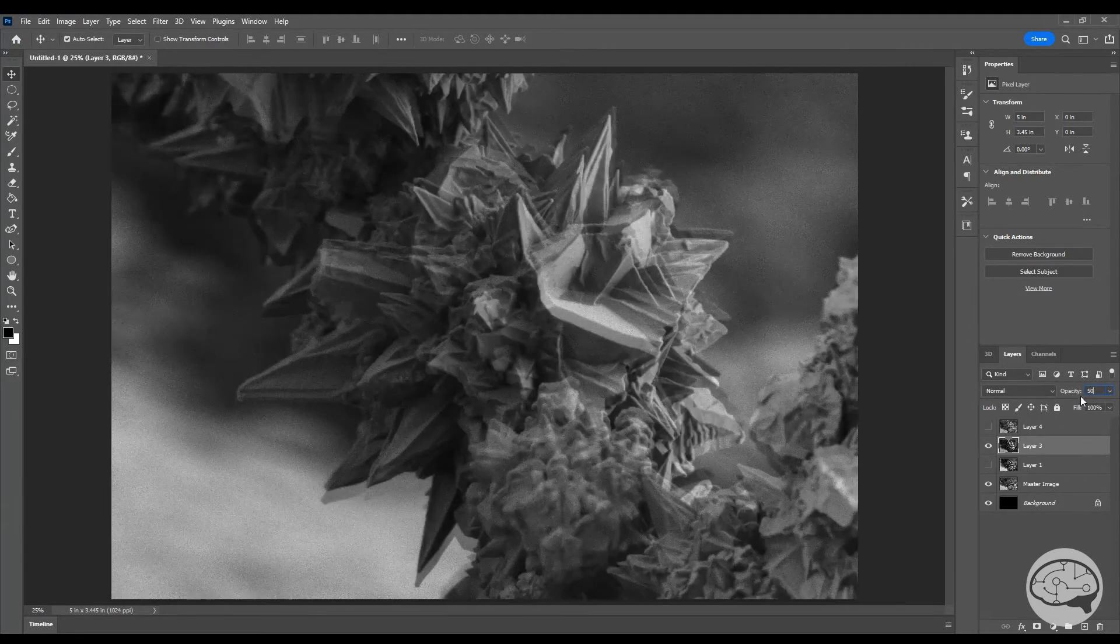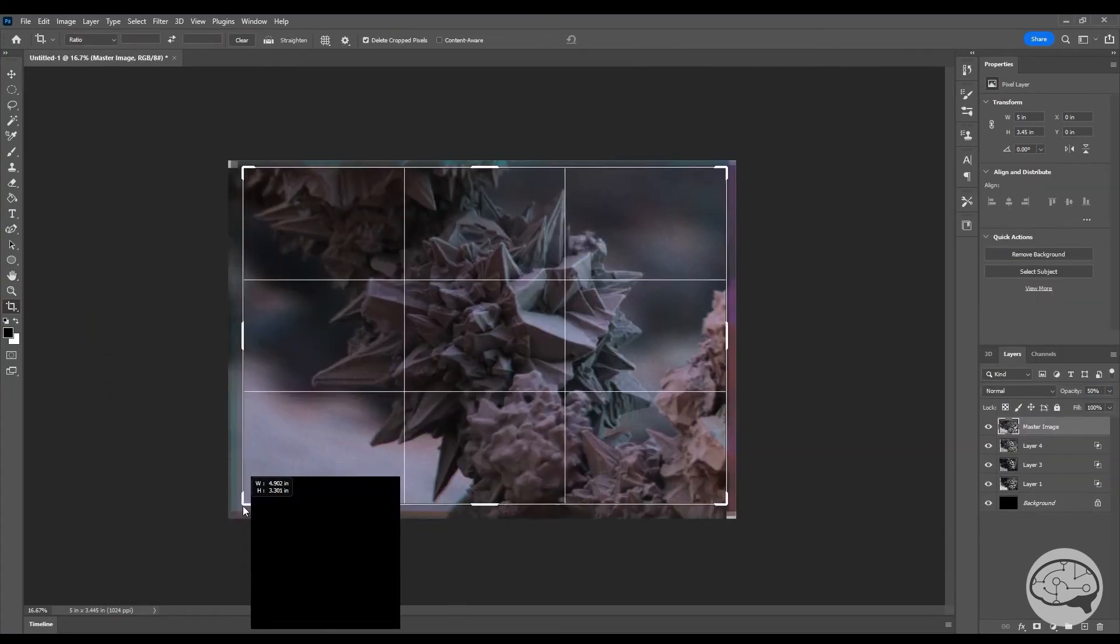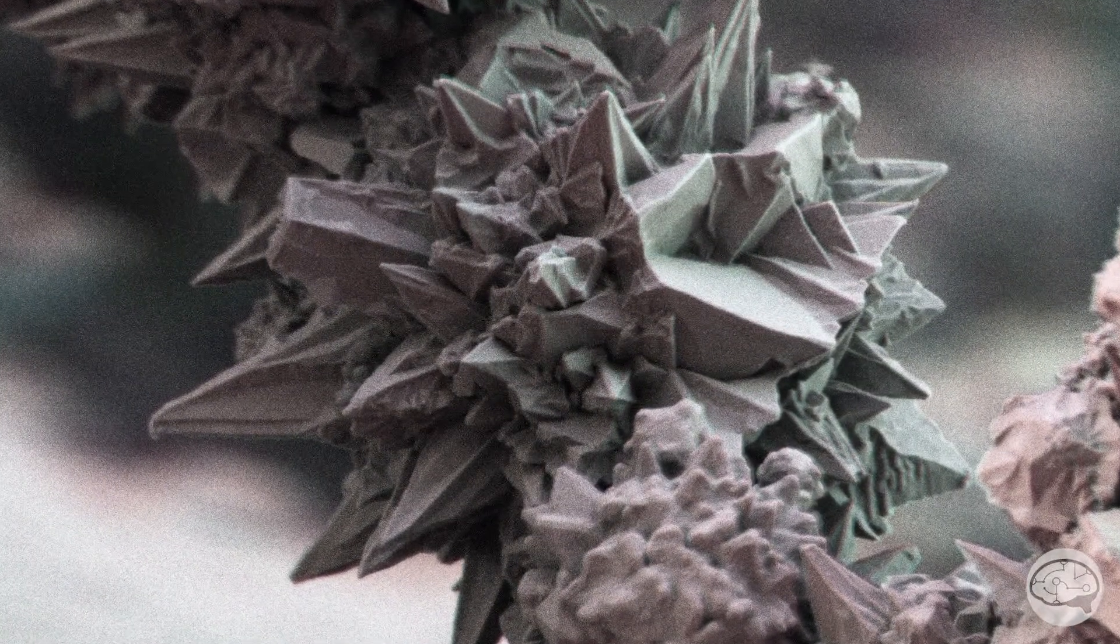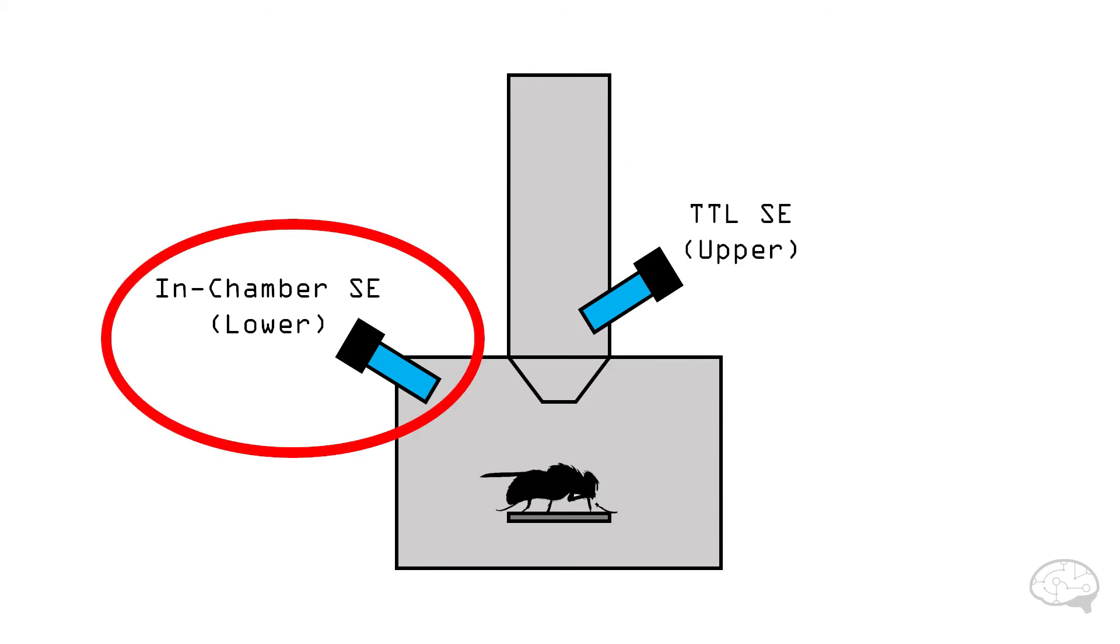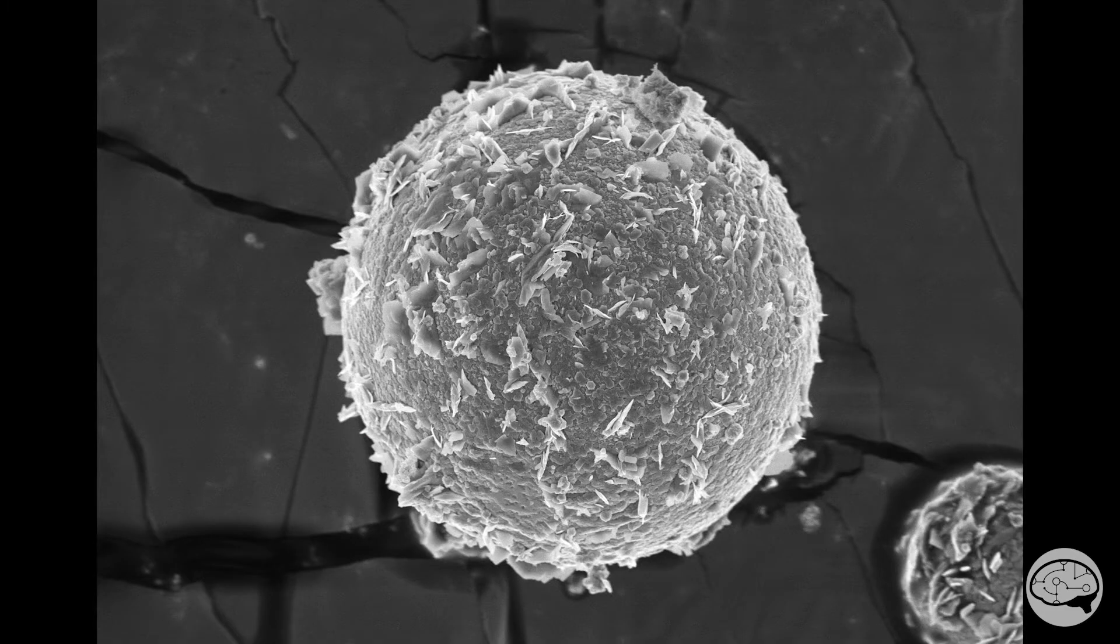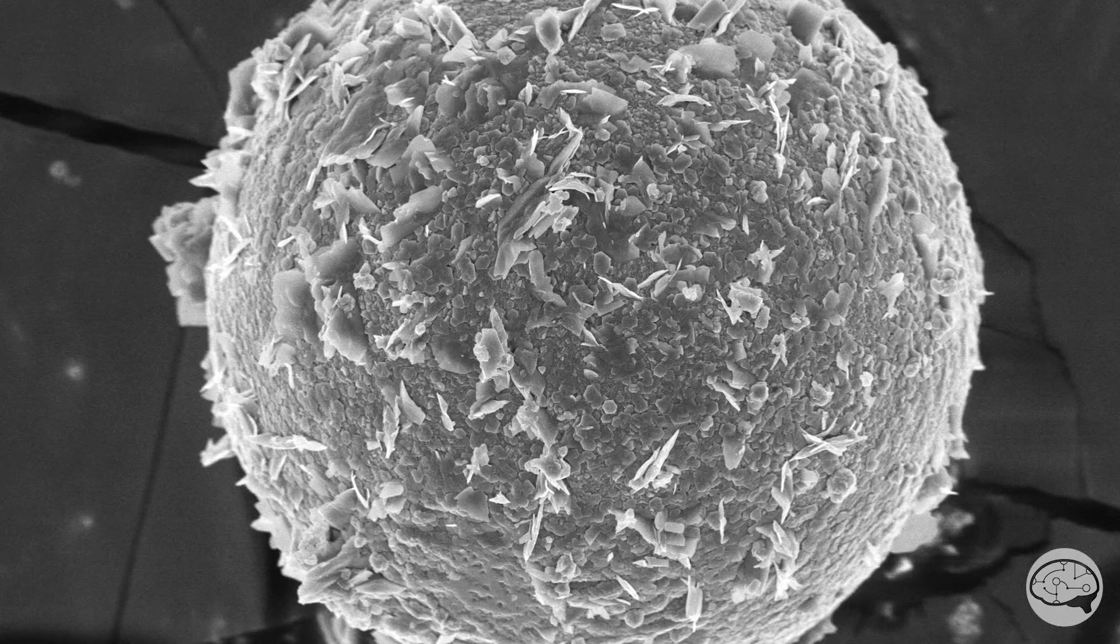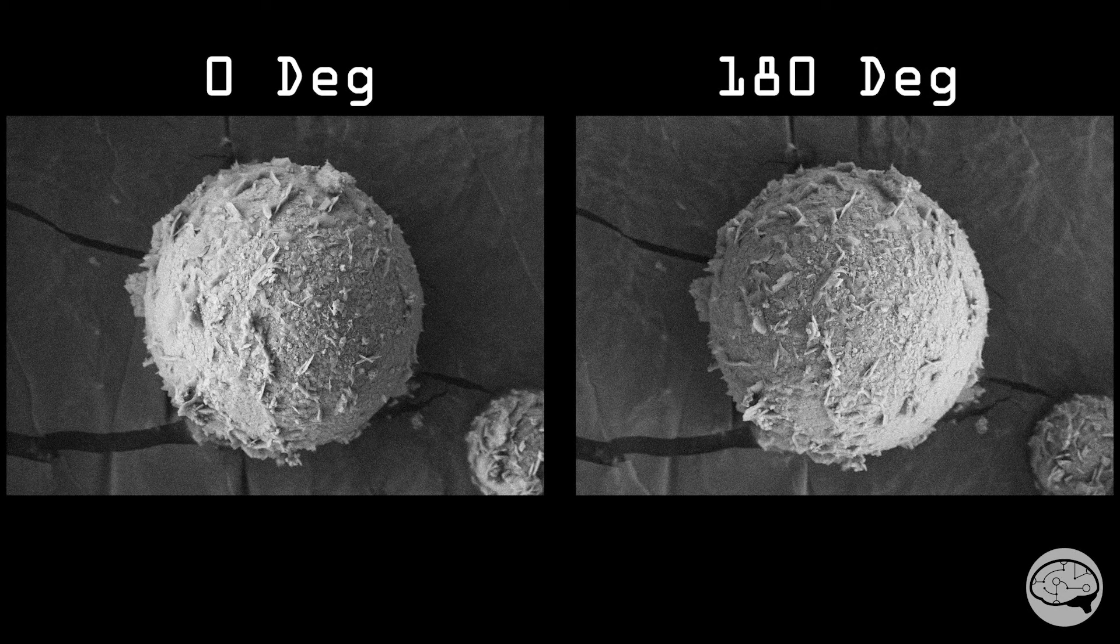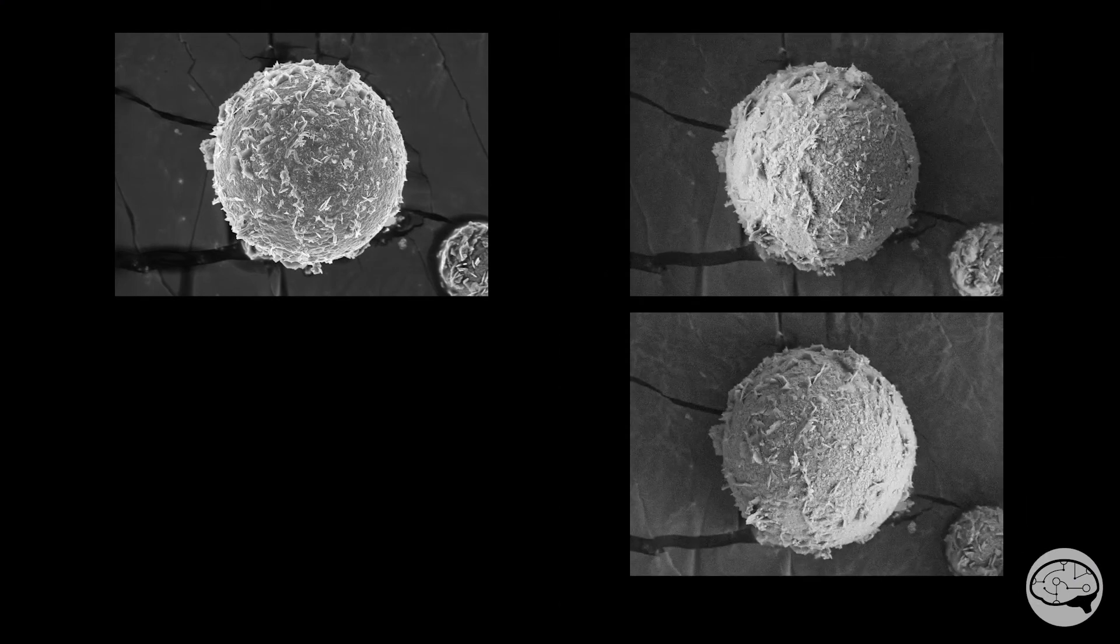Once you have all these images in Photoshop, you'll need to align them and maybe rotate them a little bit. Then choose one of them to be your master image, and the others as your color layers. One other thing I tried in my search for colorization mastery is to use an upper or through the lens detector to make a master image, and then take multiple images with a lower or in-chamber detector as the color images. I did this because the upper detector image is going to have completely even illumination since it's looking at the sample directly above it. Also, you'll be able to get very high resolution details from this upper detector. It just makes a great master image. The lower detector images may not have as high resolution as the upper detector, but they will be directional, i.e. they will have shadows on them. So I would take one master image from the upper detector and two color images from the lower detector.